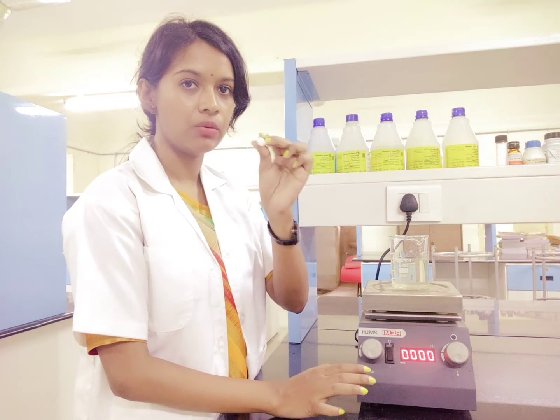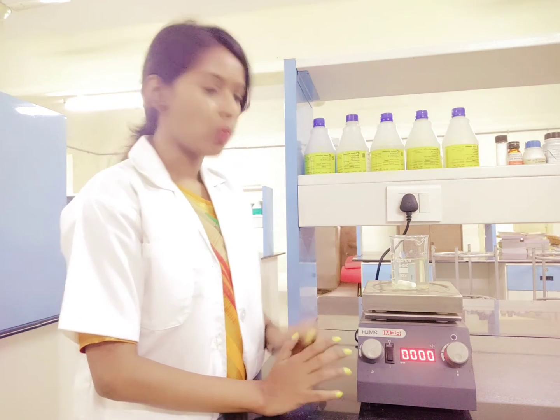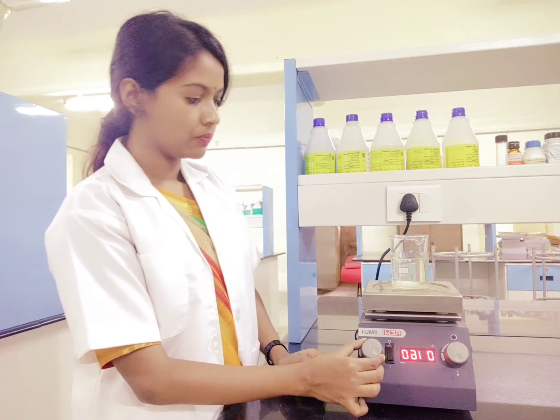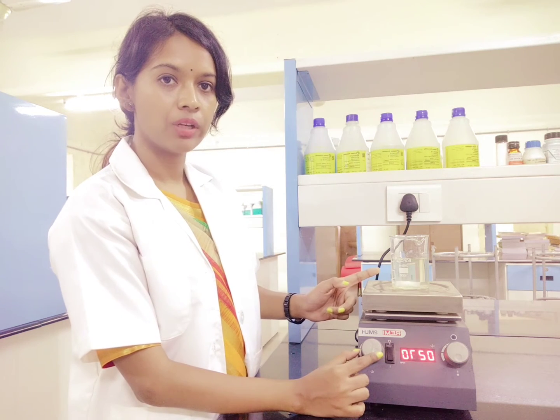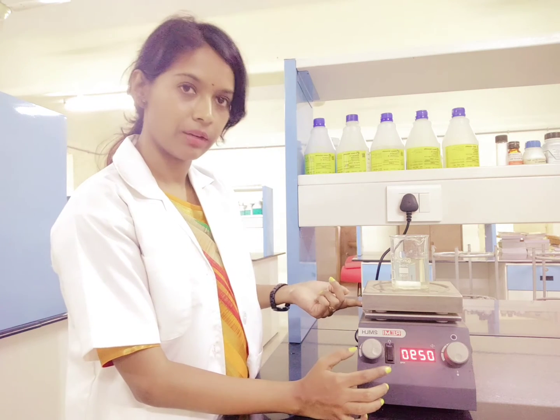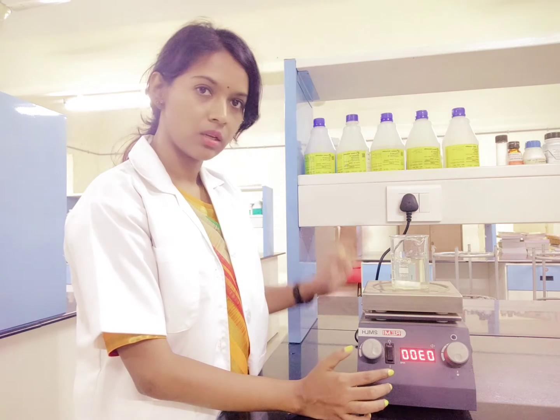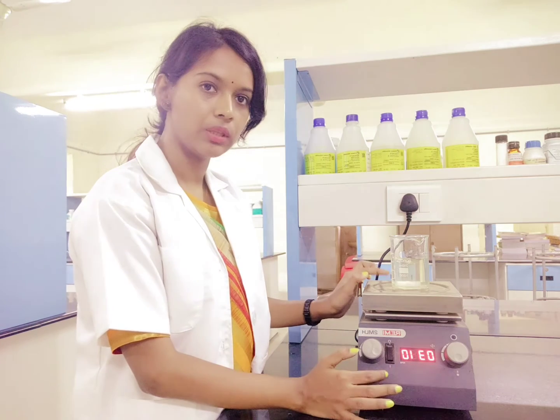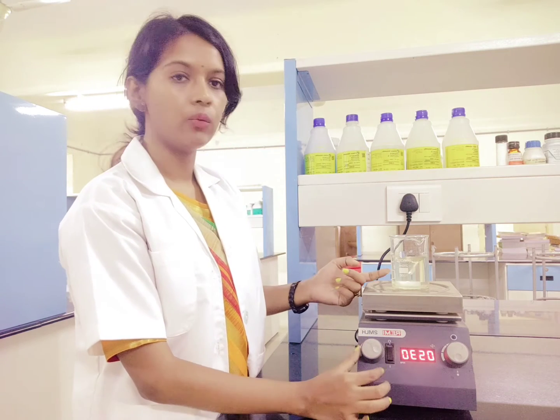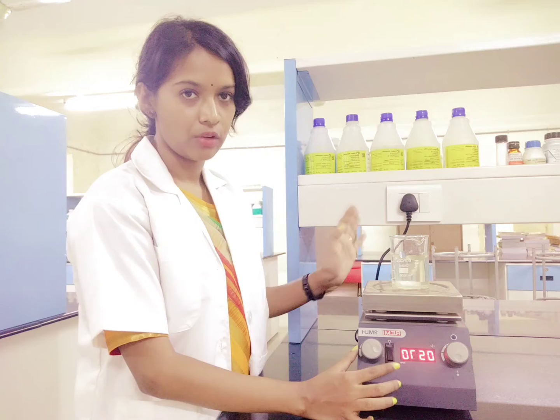I will just show you — this bead which I have in my hand, I will just put it in this beaker. Once I have put it, I just have to increase the speed. Once I increase the speed, you can see this bead is moving now, and it is moving because inside, along with the motor, the magnet bar is moving. That bar is in coordination with this bead that you have kept inside. As you increase the speed, you will see a stirring effect in the beaker that you have placed.